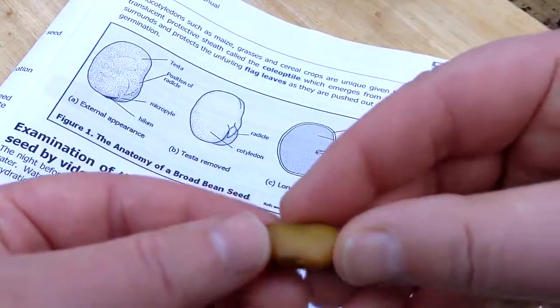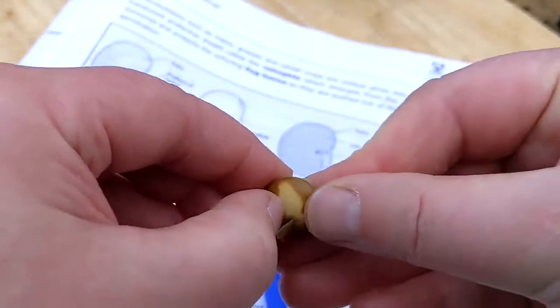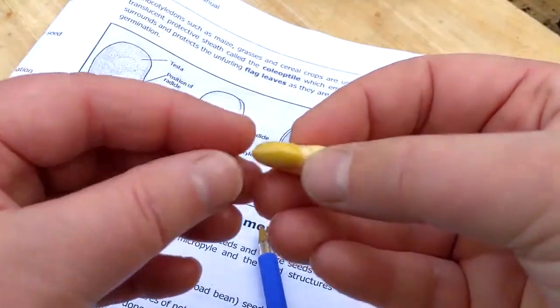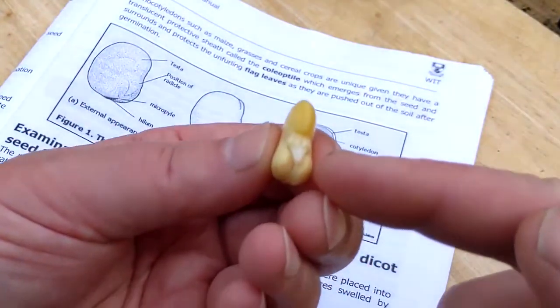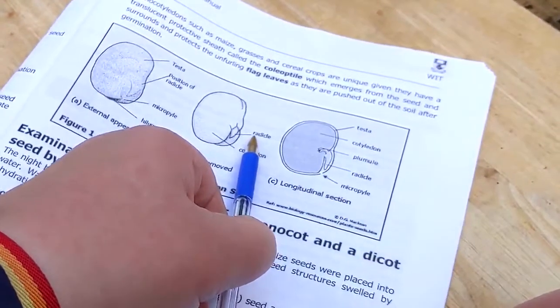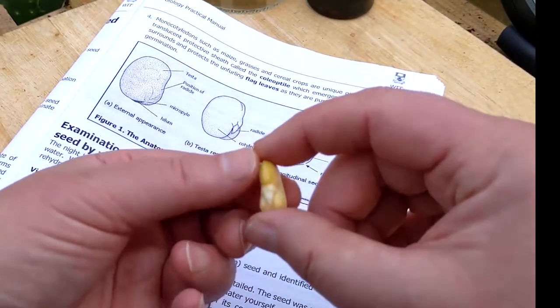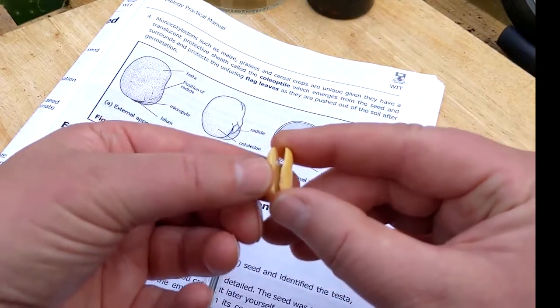The next thing we need to do is take the seed coat off. You can stick your nail into the seed coat and peel off this brown, almost rubbery layer. Here you can see what the swelling looks like under the seed coat — that is the radicle. When we take the seed coat off, we can see that the seed is actually in two parts, with a natural cleavage down the middle.